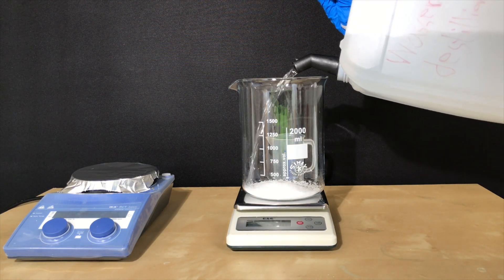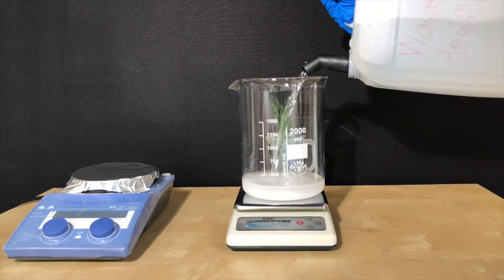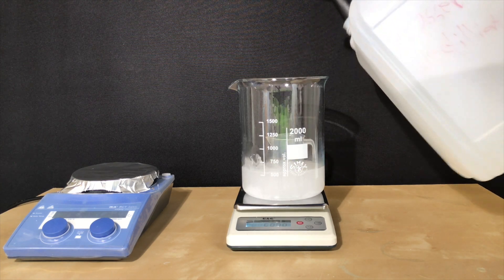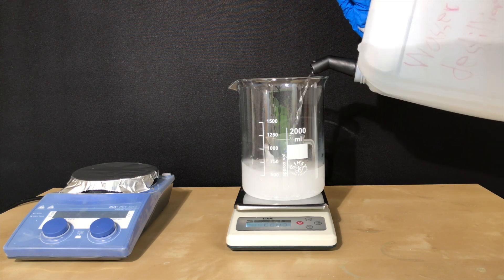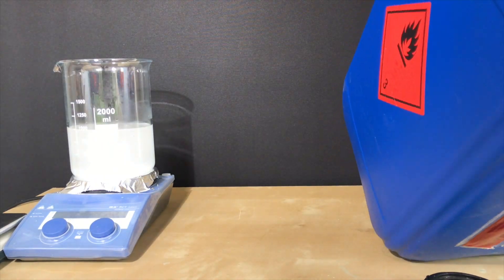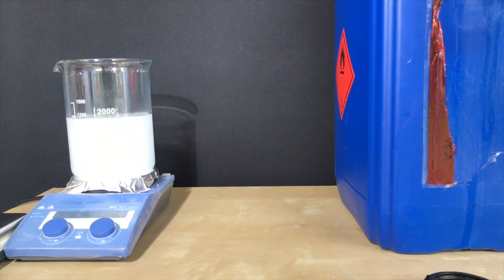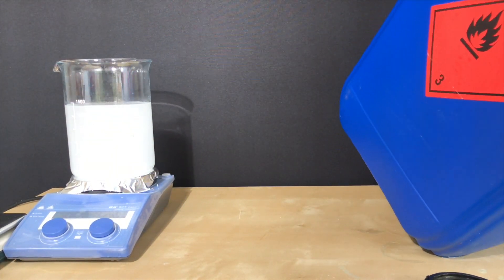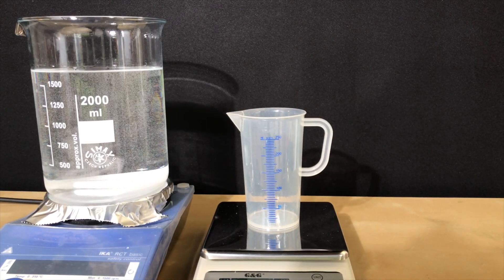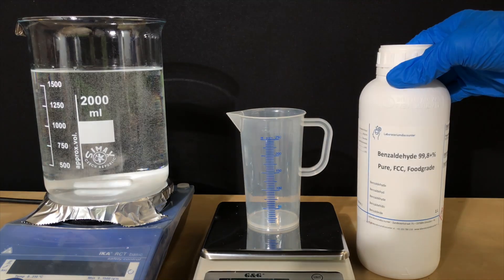Afterwards, 900 milliliters of distilled water were added to the sodium hydroxide. You should normally do this the other way around because it could get hot and end up splashing, but if it did I would be able to dilute it. With this measuring cup we measured out 700 milliliters of ethanol and simply added it to the water-sodium hydroxide mix. Without cleaning the measuring cup we then weighed out 106 grams of benzaldehyde.